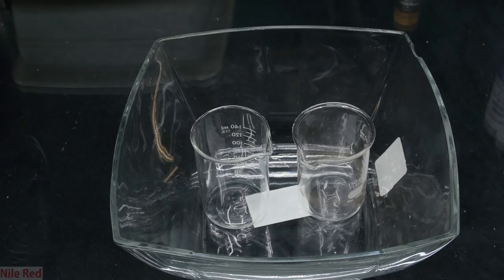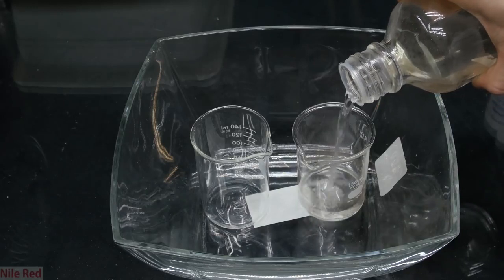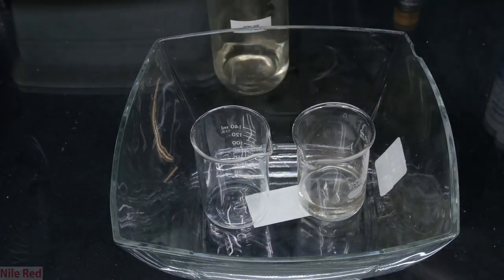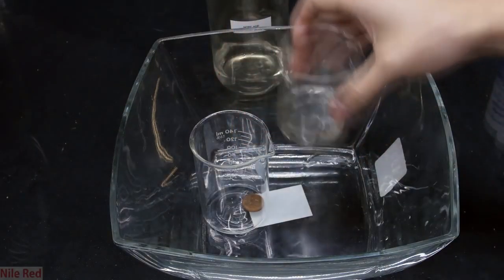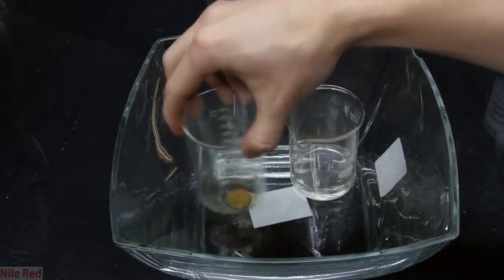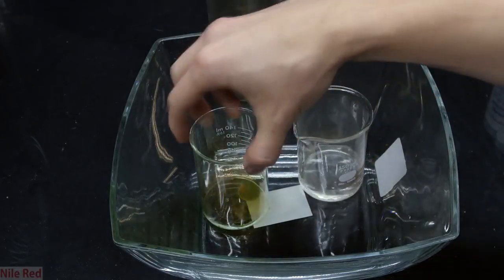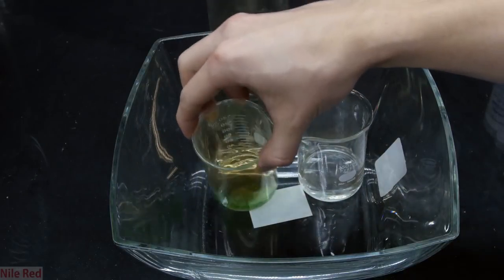So now onto the last acid, which actually turned out to be the worst of them all, which kind of surprised me. So into a beaker, I pour in a little bit of concentrated commercial grade nitric acid. My demonstration for this one is the reaction between nitric acid and copper. Nitric acid will react quickly and very vigorously with copper. It will produce a green copper nitrate solution, and it will also produce a lot of red nitrogen dioxide gas.